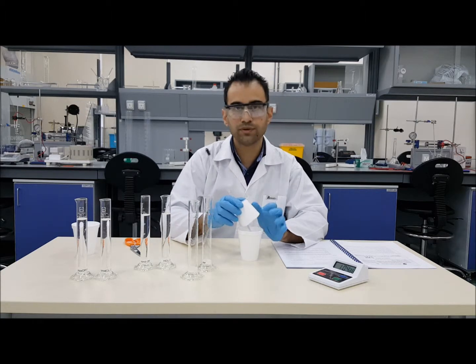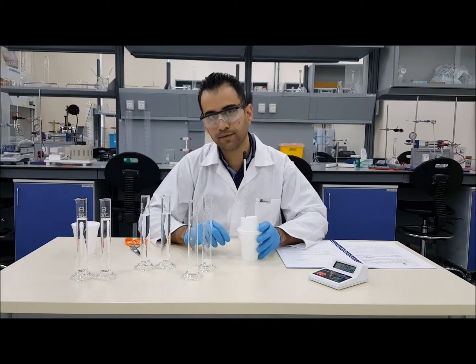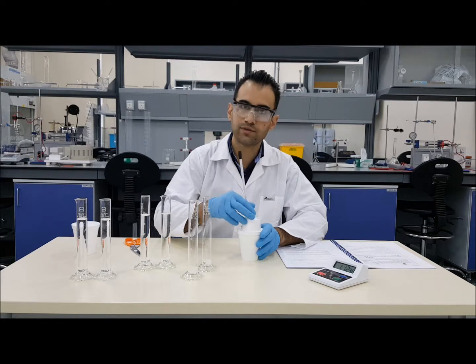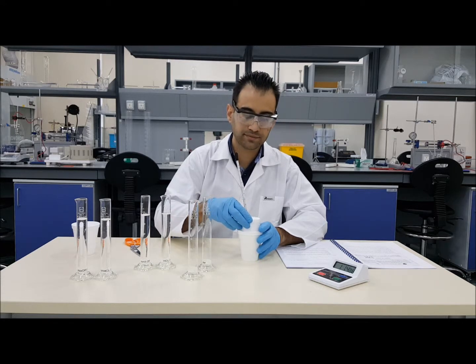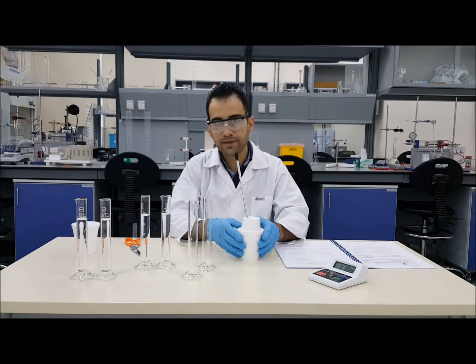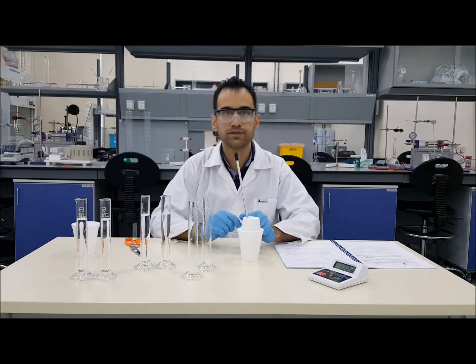Always remember, don't throw used chemicals into the sink. A waste container will be provided for you, and you can use that for that purpose. And always be careful and keep it well balanced to avoid spilling all the chemicals on your workstations.